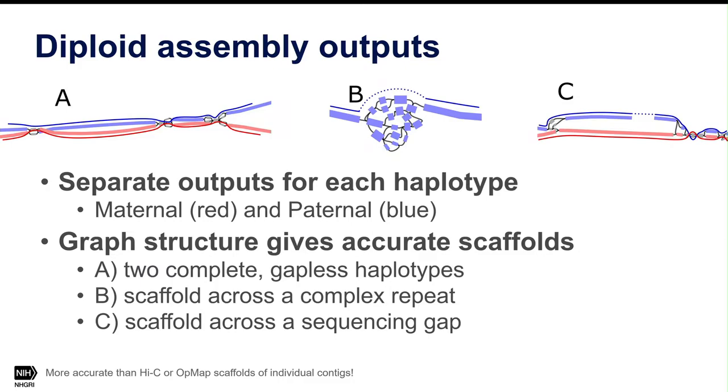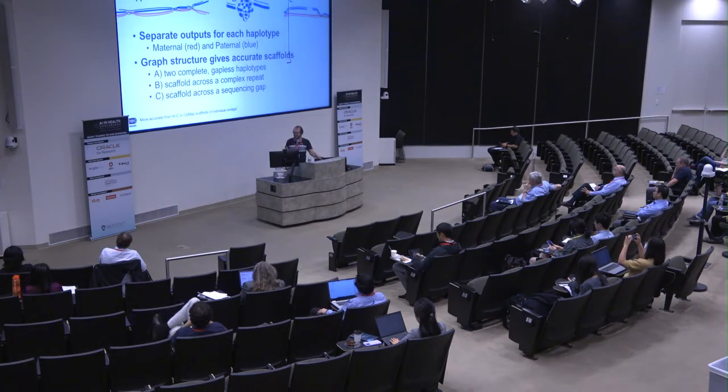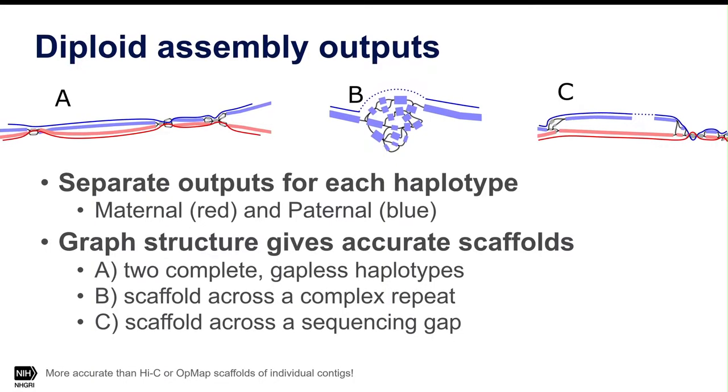And then in some cases, like when I showed you, there are some sequencing contexts that make PacBio HiFi data not generate any reads. So there's a coverage gap here. This can be haplotype specific. And we do try to patch it with ONT data, but sometimes we fail to do that. We don't close every gap. And so in this case, if we have a gap in only the paternal haplotype but not the maternal, we can again infer that this must be connected to this, and we're missing sequence here, right? And we can still tell you that these two go together.